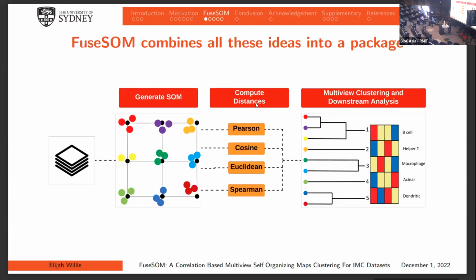And then I was wondering, how is that affected by the number of clusters you are selecting? I mean the different distance measurements. The number of clusters I'm selecting is post hoc to that. I compute the distances on the prototypes. For example, if I project an 800,000 by 20 matrix to a 10 by 10 matrix, so 100 points, I compute these distances on that, then cluster the distances, and then map it back to the original cells. That's where the speed comes in.